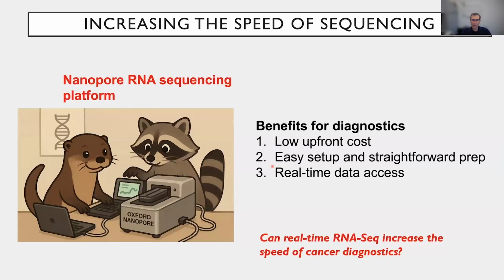All right, so now this is what you're here for, to see how this performs with Nanopore RNA sequencing. And I think the benefits have been really beautifully outlined by Patrick: low upfront cost, easy setup, real-time data access. It's actually the real-time aspects of the Nanopore that's more exciting to me than even the long reads. And so we asked whether we could marry this informatics platform, as well as the know-how and the atlas that we've developed over the years, with the speed and portability of the Nanopore.